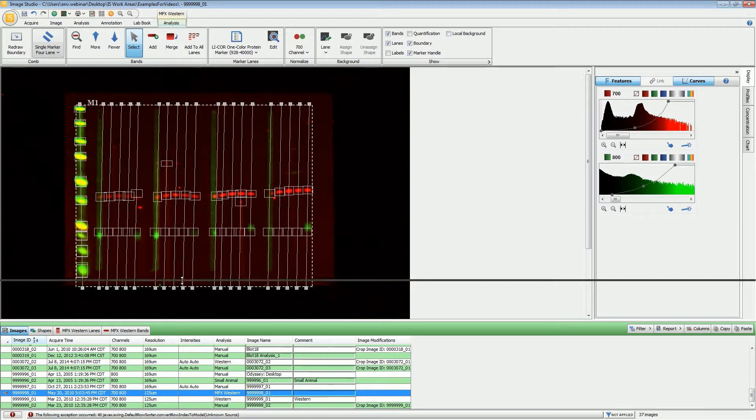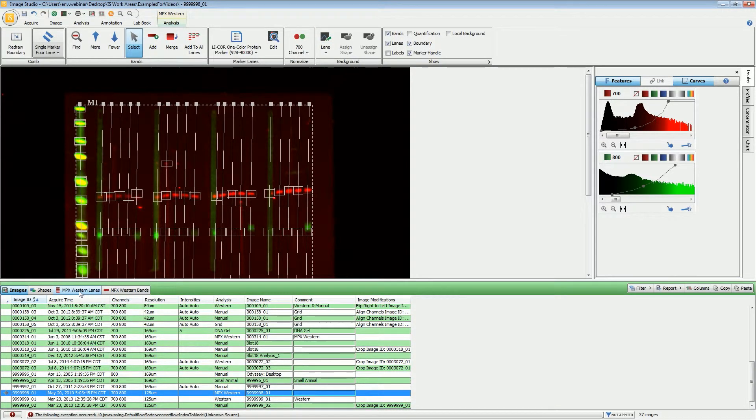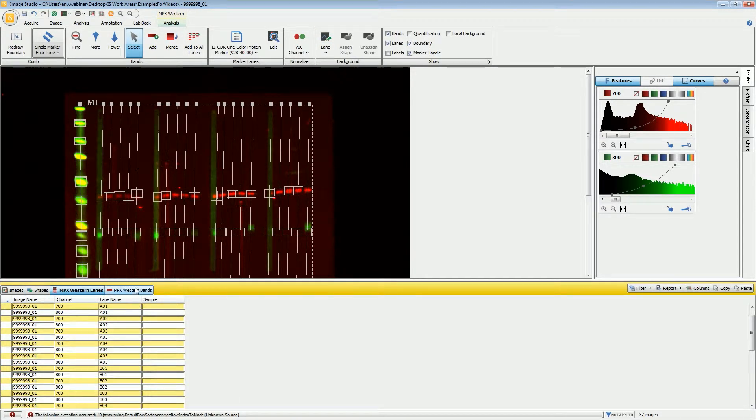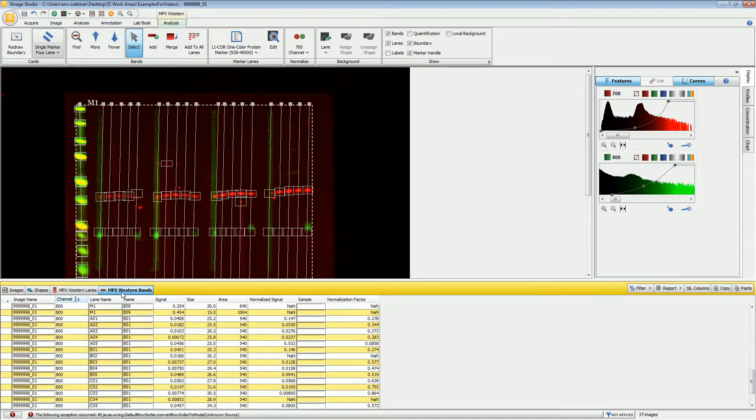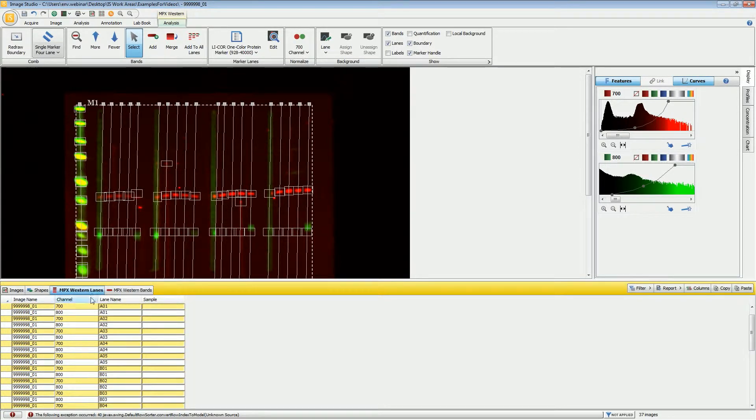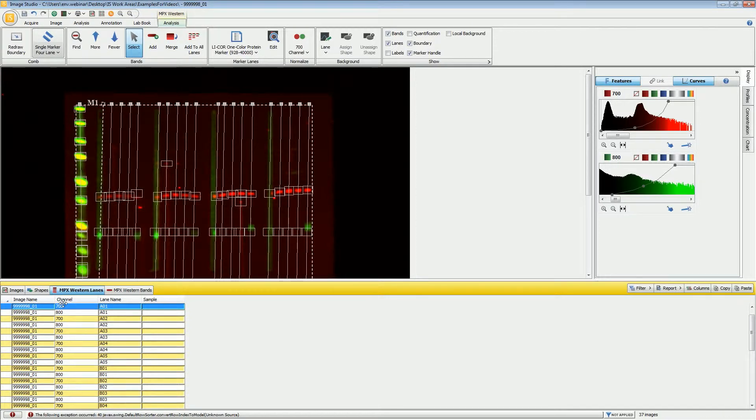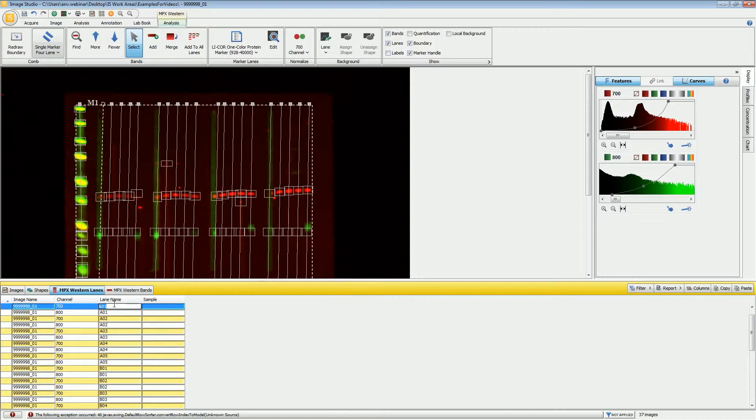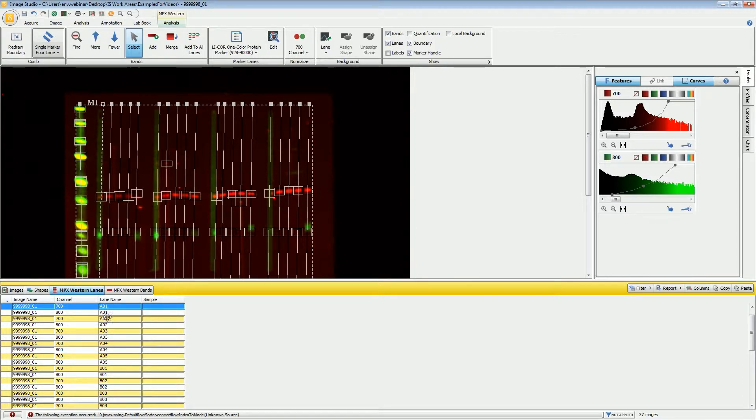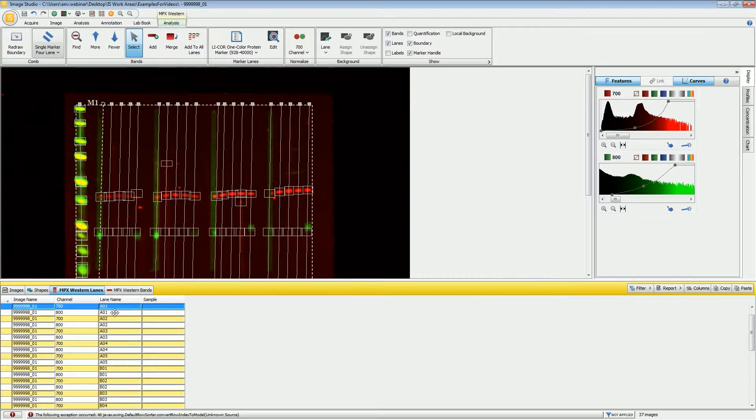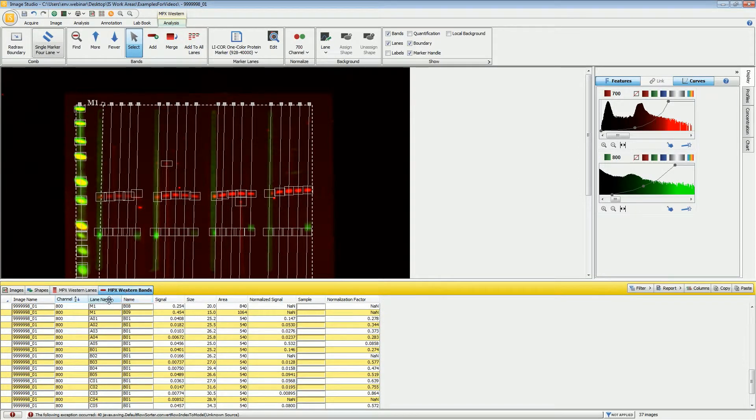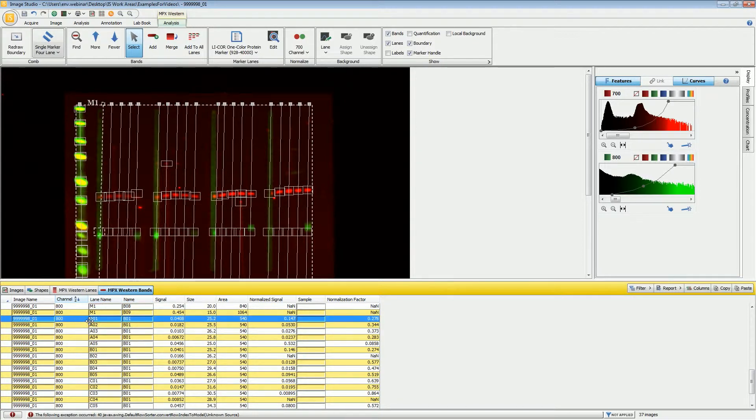As we get into the data down here, we have two new tables that appear: the MPX Western Lanes and Western Bands tables. Here in the lanes table, if I highlight this one, you see that this becomes active. If I were to change the name of this lane, so if I were to put the antibody information that were the antibodies that were used in this particular lane, the lane name is also available on the bands table and that name would be changed there.